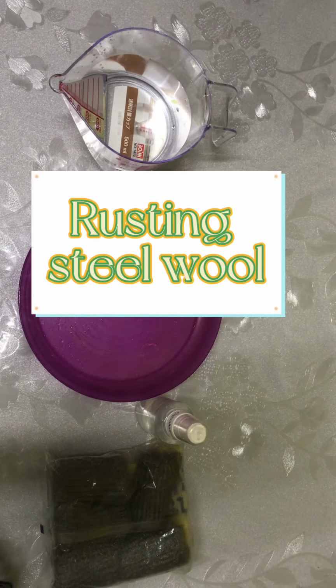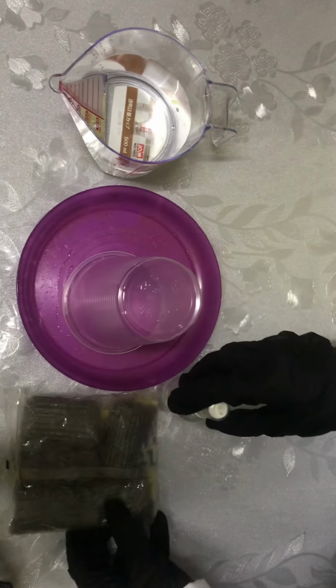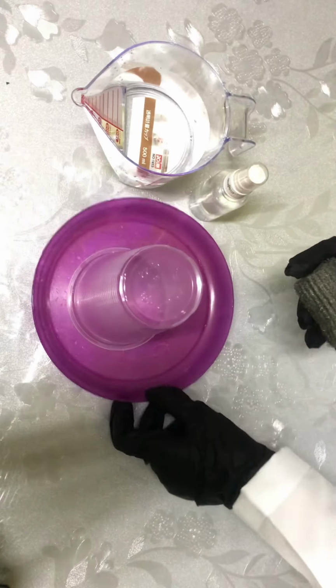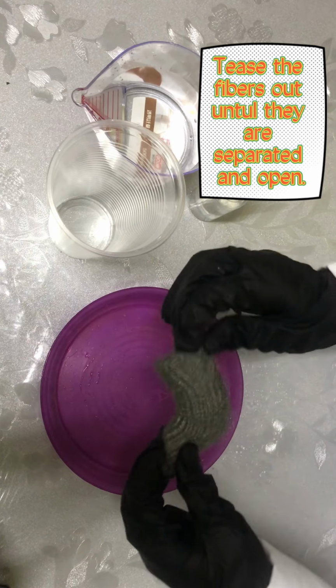And the last one is rusting steel wool. The things that we're going to need are a glass, a dish, water, and steel wool. First, tease the fibers out until they are separated and open.